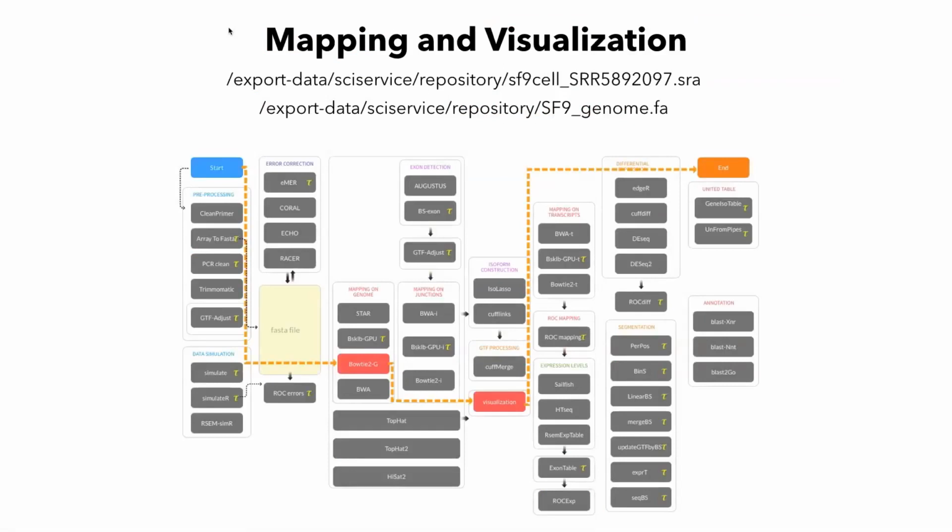And then we have a reference genome. So this is something that was taken from a publicly available data set based on production of biologics, so production of vaccines, a cell line that was used in the production of vaccines. And we want to see how we can map those reads onto the reference genome.